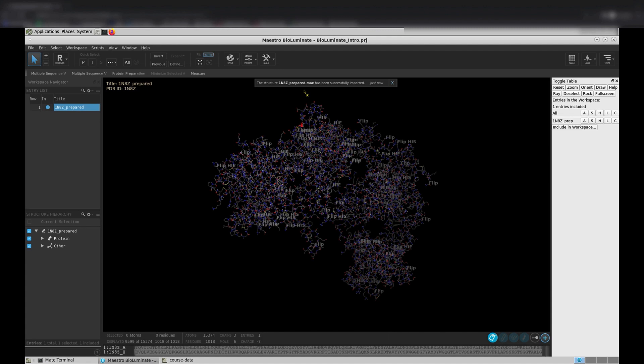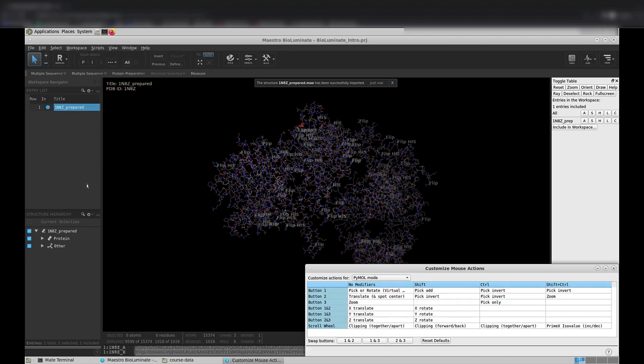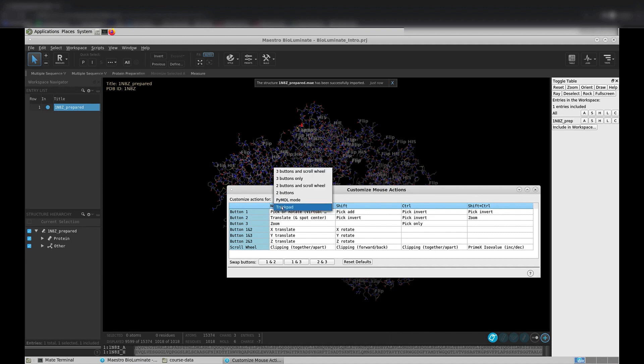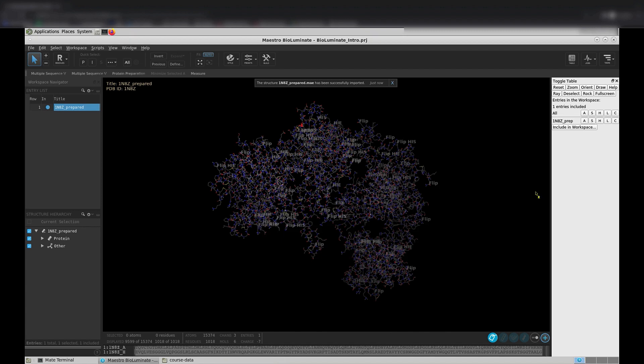There are many different ways your mouse can interact with the BioLuminate interface. You can customize your mouse actions for whatever mouse you are using by going to Workspace, then Customize Mouse Actions. For example, if you are using a trackpad, you can select the Trackpad mode. If you are a PyMol user, it might be helpful to use the PyMol mode. PyMol mode is the default mode in BioLuminate, and we are going to stick with that. For the duration of the course, all videos and instructions will be made using PyMol mode.